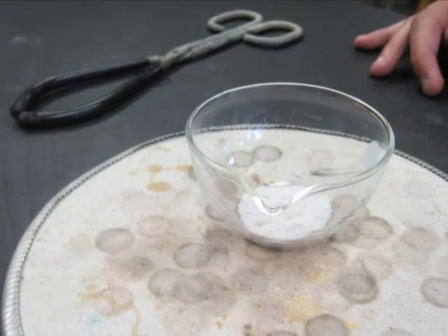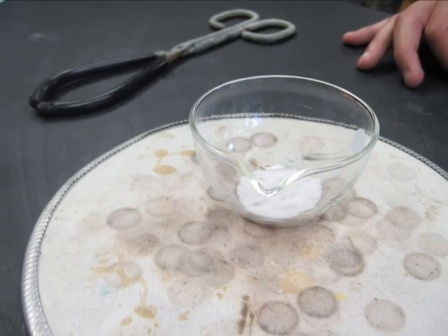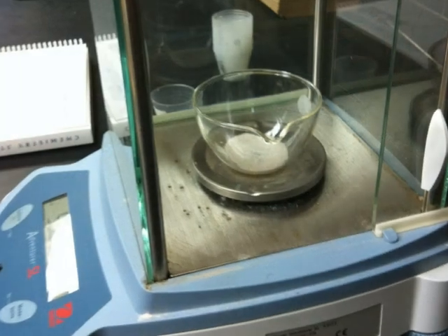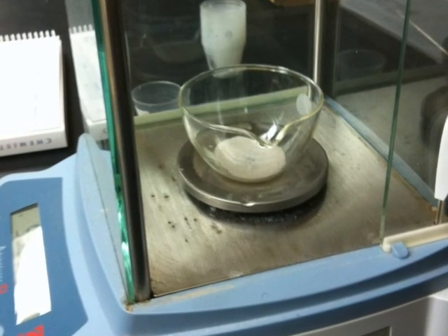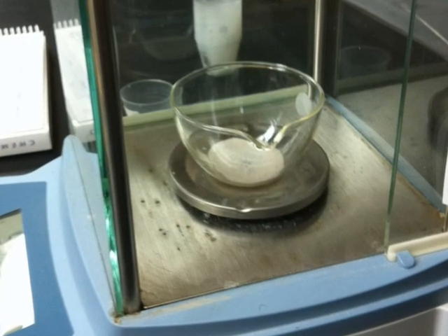Wait until the sample has completely cooled. Determine the mass of the sample. It will now weigh less. The difference in mass is the mass of the ammonium chloride.